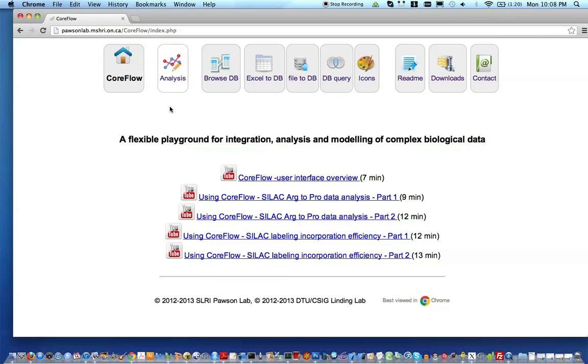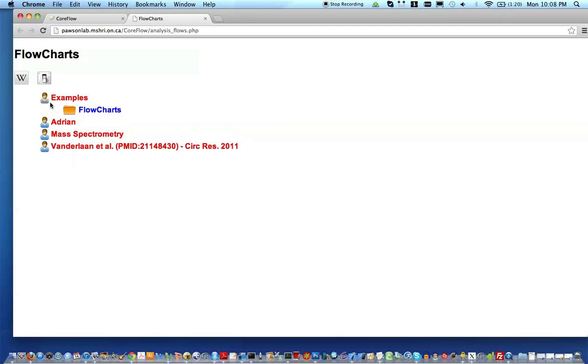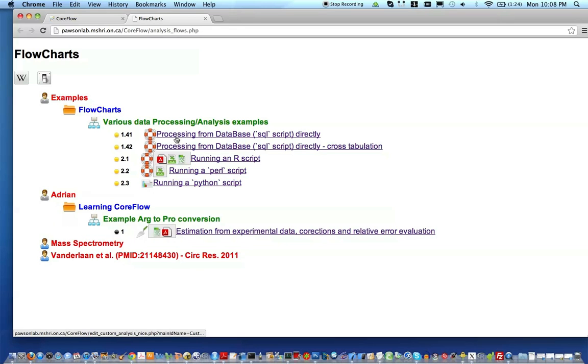So the goal of this internet-based application is to organize everything into smaller tasks and to present them as pipelines. So this is the main item in the menu, which shows you that we prepared here a number of tasks because all complex analyses can be split in smaller tasks or steps. Those are the steps. They are sorted here by their number. This is a floating number that helps you rearrange everything in whatever order you want.